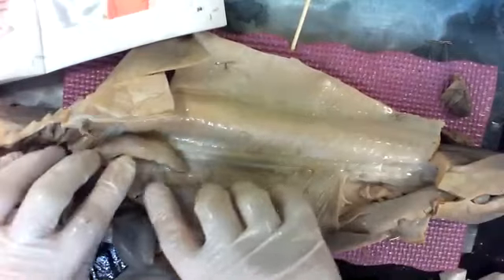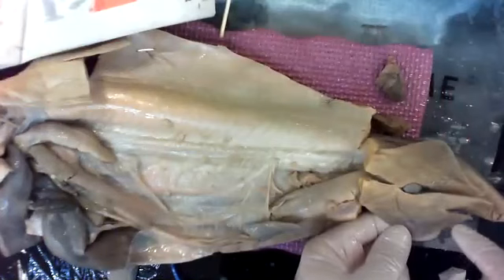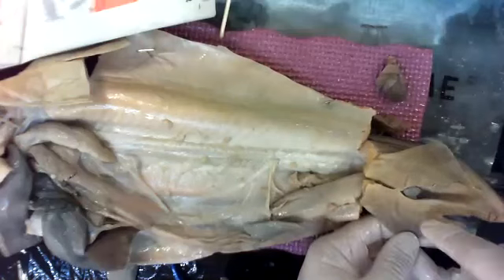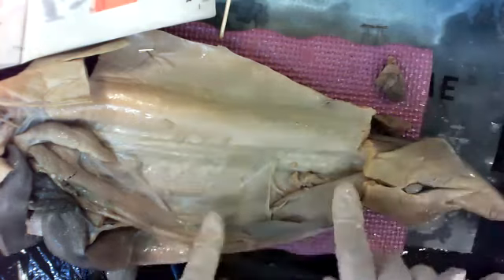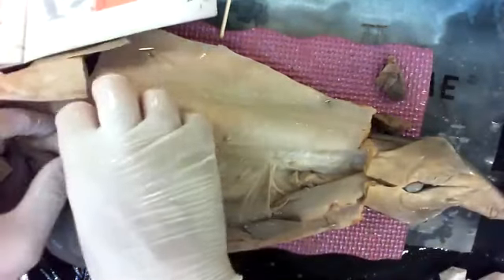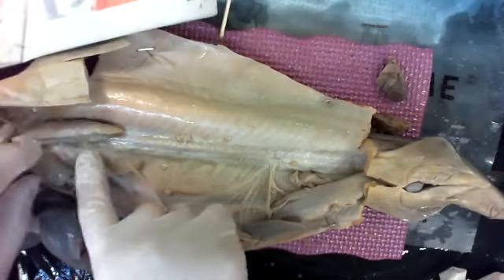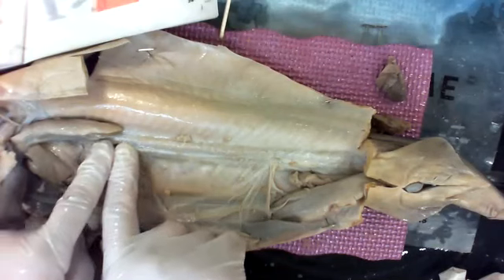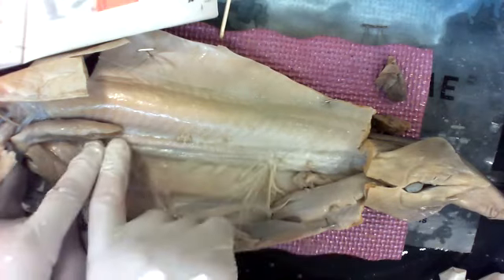Right. Next, mine was a boy. Pelvic fin, extra part. If you just have a pelvic fin and there's no groove here, you have a girl. So all the way up here, this is the testis, the male reproductive gland. This makes sperm. As the sperm's passed out, it goes down. You can see it's connected right here. And you see that tube? It's kind of coily that runs all along here. This is called the vas deferens.